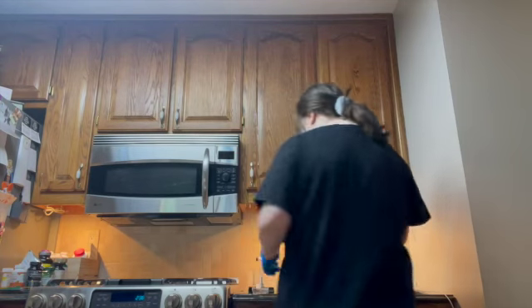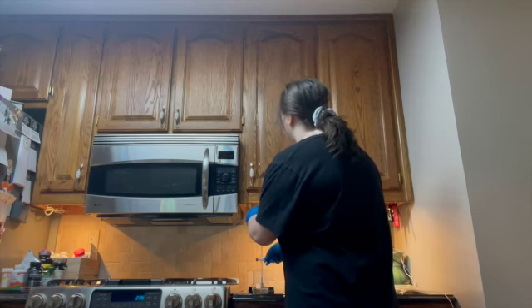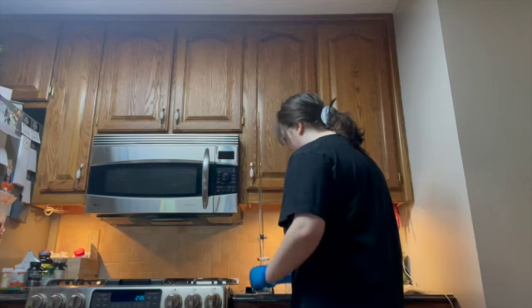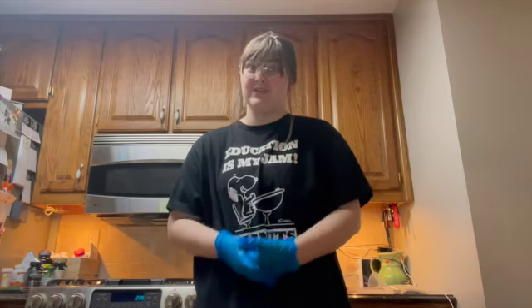So let's begin. I'm just going to turn it. I'm going to let it go. It's stuck. Okay. And that is our first. Now let me stir it around for a second. And that is our first titration, and I'll be back whenever I have more results.